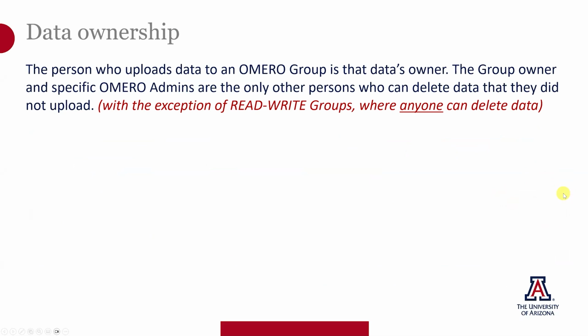One exception to this rule would be if you were set up in a read-write group. This permission level, which requires an administrator to grant, allows anyone in the group to delete any data. Read-write groups assume a very high level of trust.